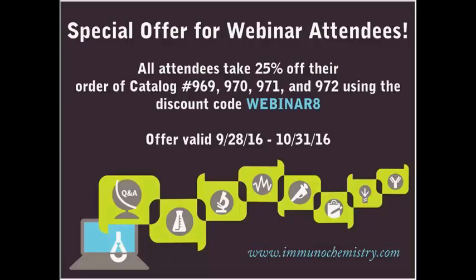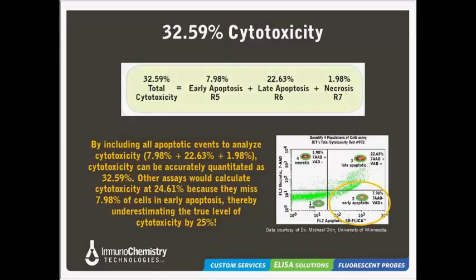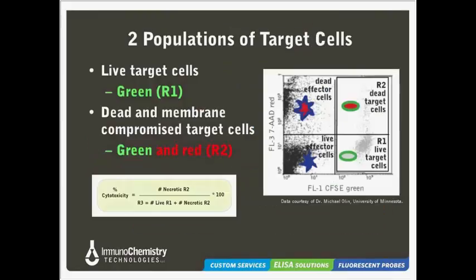So it looks like the first question asked here, someone's wondering how they determine the percentage of cell death from their treatment using the cytotoxicity kits. Oh, okay. I put those calculations up here. Let me go through that quick. In the basic kit, you can just create a gate around all the cells which are stained green, those are the target cells, and then count how many of them are simply stained red with 7-AAD, which is in the upper right.